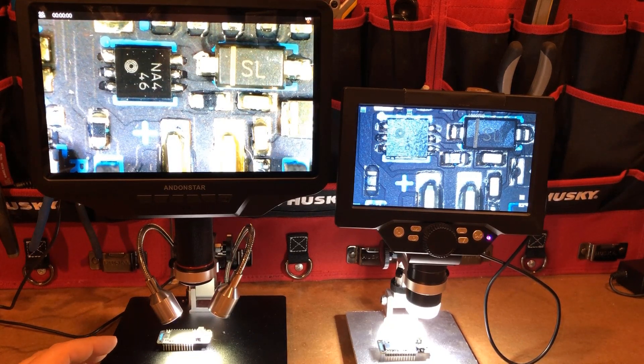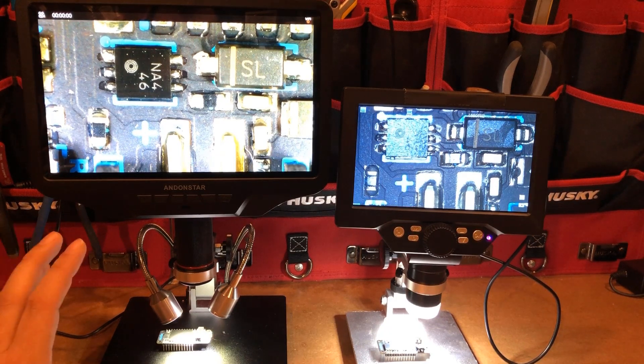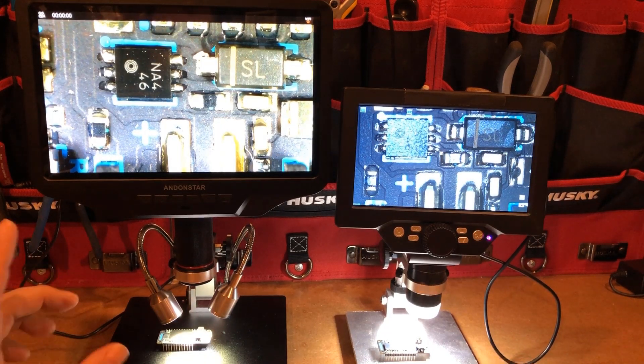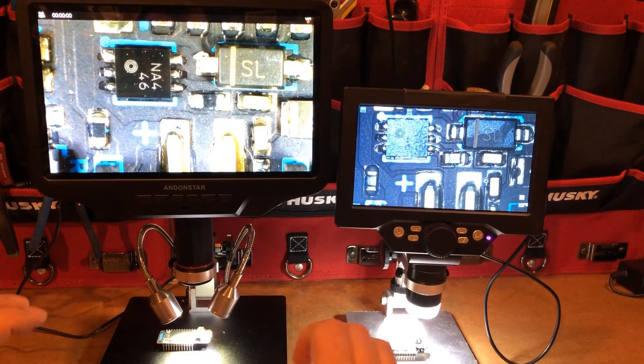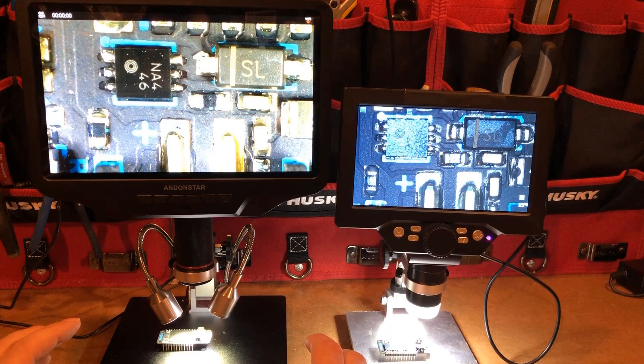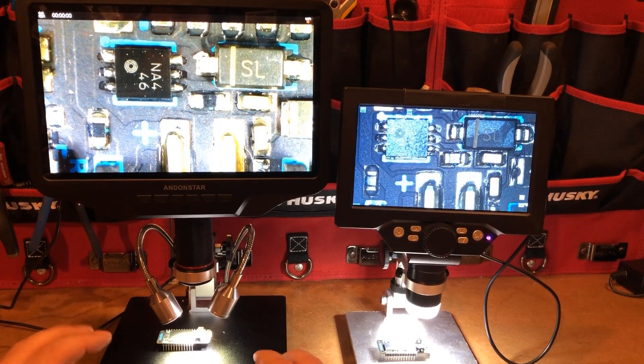This is the Andonstar AD409 microscope, and as you can tell, it is a little bit different. There were a couple of reasons why I specifically wanted this microscope. All of these scopes will connect to your computer basically like a webcam, but this one has HDMI out, which allows me to put it on a giant screen and get basically real-time, high-resolution, high frame rate streaming and capturing of what's going on in the microscope. USB quality wasn't very good, and microSD isn't live and also wasn't great quality. So I wanted something with HDMI and this fits the bill.